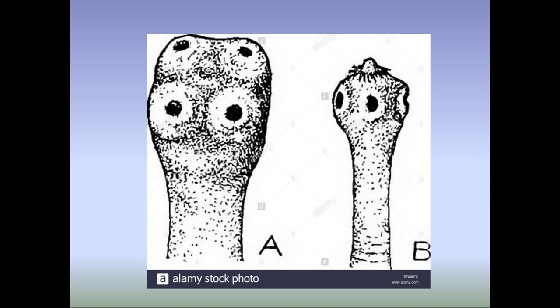See the diagram. If this diagram is given in the examination, we have to identify this Taenia solium scolex. See, the neck is also there. It is situated next to the head, below the head. It is a narrow growing region from which proglottids arise.